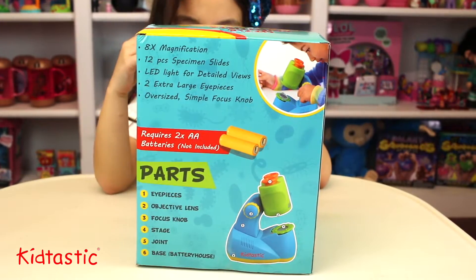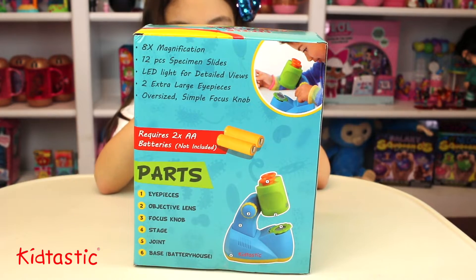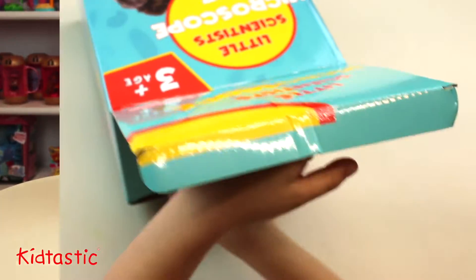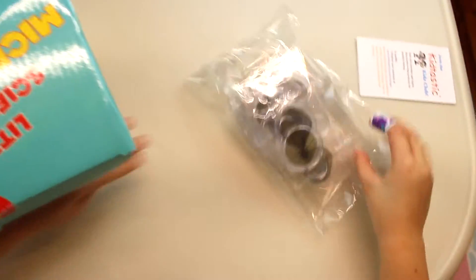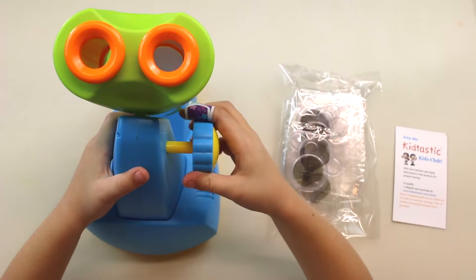So here are the different parts. It needs two AA batteries, but let's just check it out. This is what came in the box.